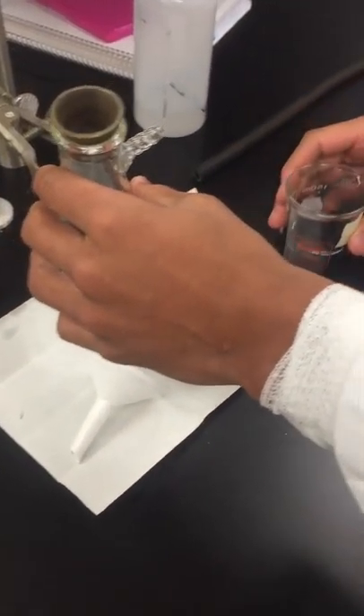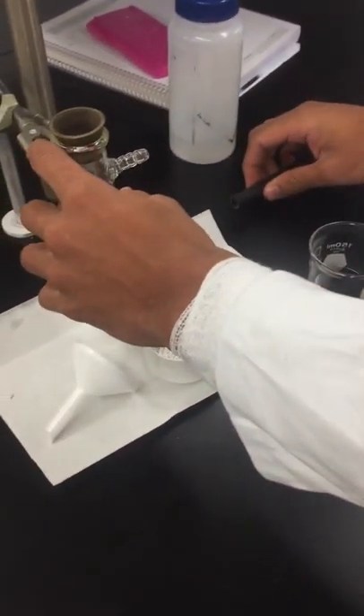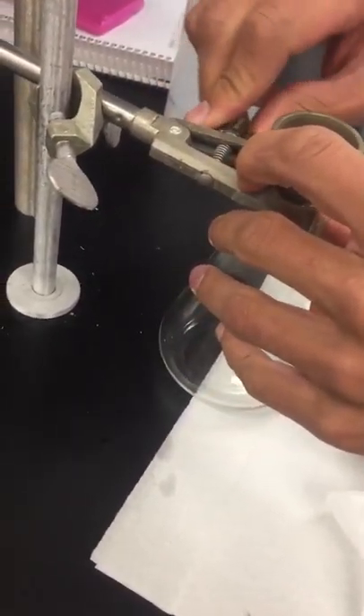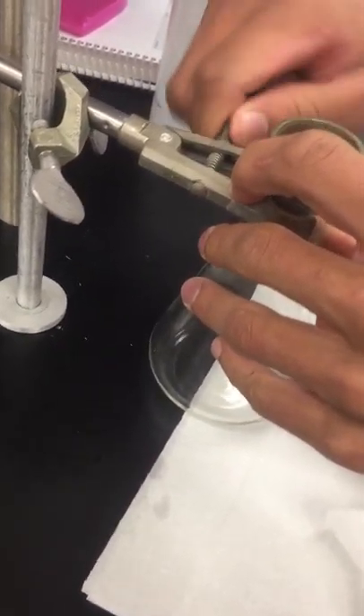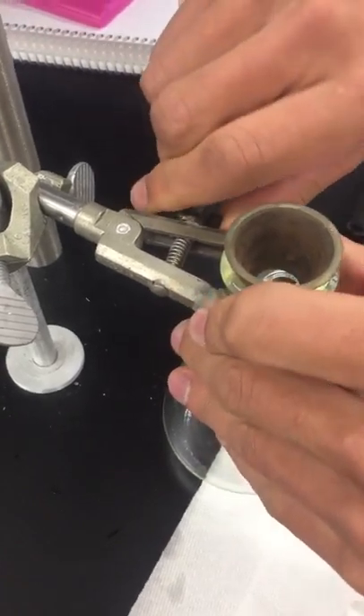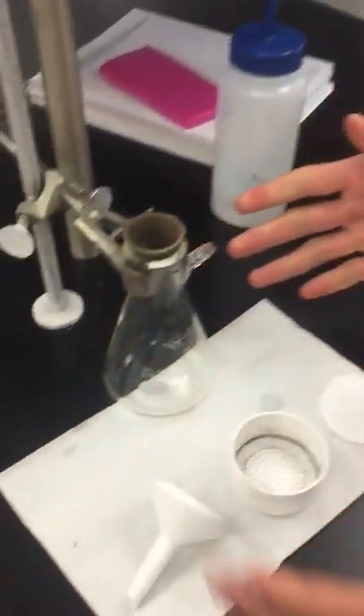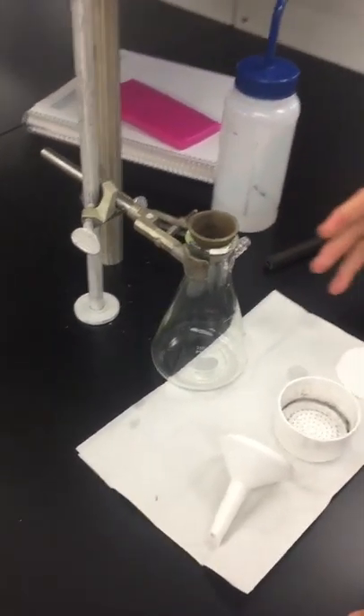In order to get this set up, what we're first going to do is take our filtration flask and clamp it into a clamp. You're going to want to make sure that this is tightened, as we do not want to have any sort of leaks — there could be toxic chemicals in this that we don't want to have spill over. We attach a vacuum hose, so this is a very important part of setting up the system.